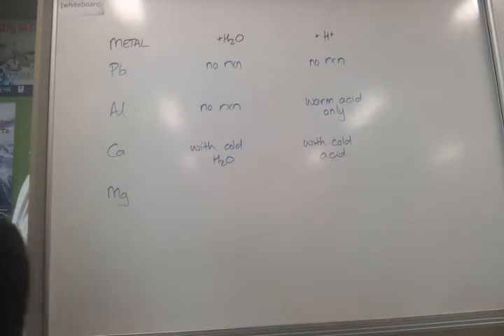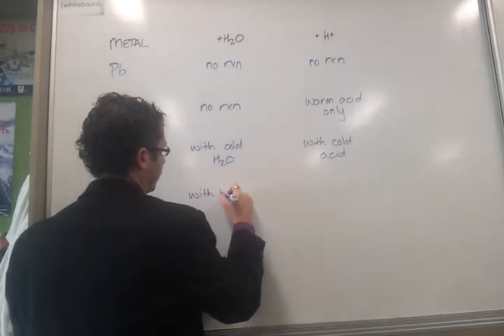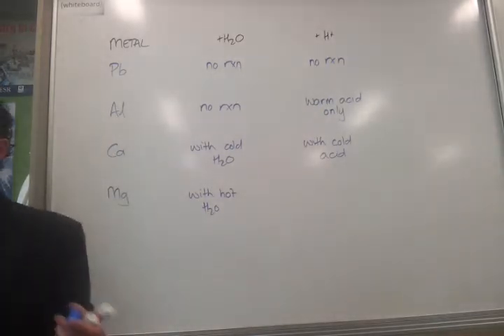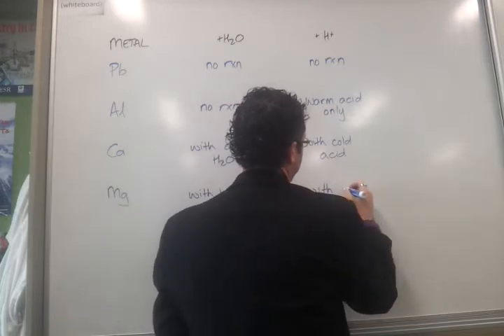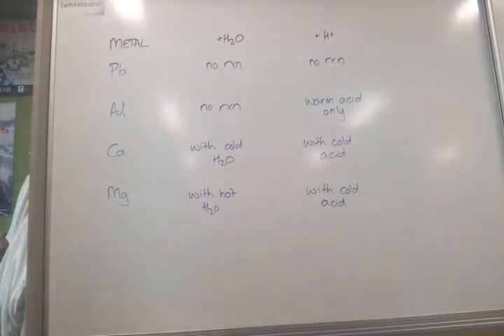Again, you go with what you observed. So we had two different possibilities here. Some of you did get it with hot water. I will say it probably needed to be hot, not just lukewarm for this reaction to happen. So those that got a no is probably because it was not quite hot enough. But if you got a no, stick with that because we're still going to see a difference here. Did magnesium react with cold acid? Yeah, it did. And this is what we often do. So we could just create an activity series for this quite easily.